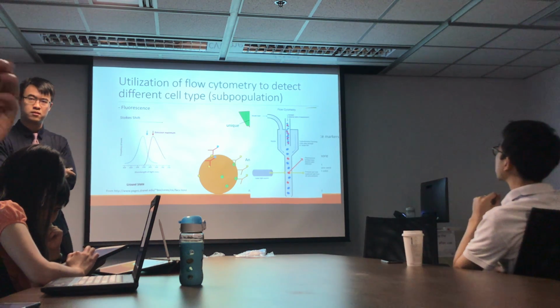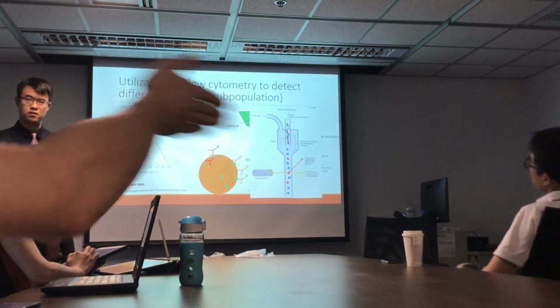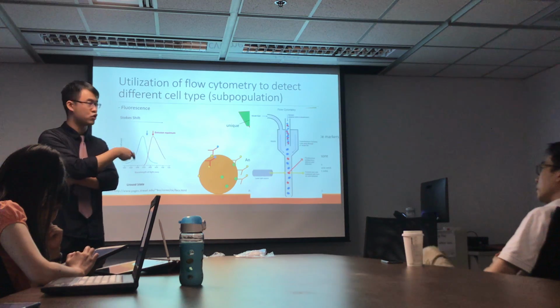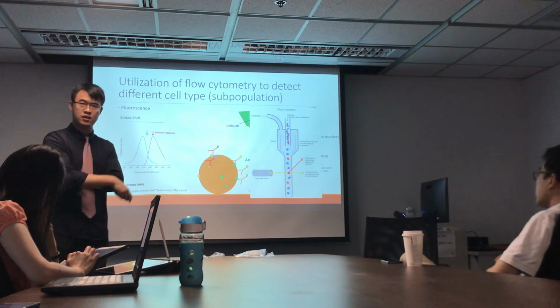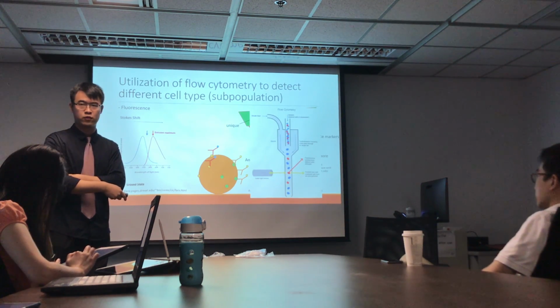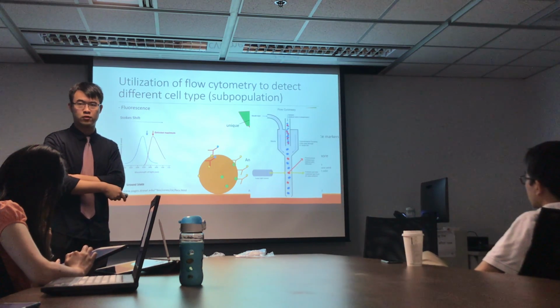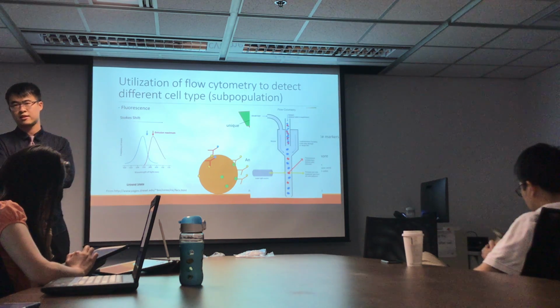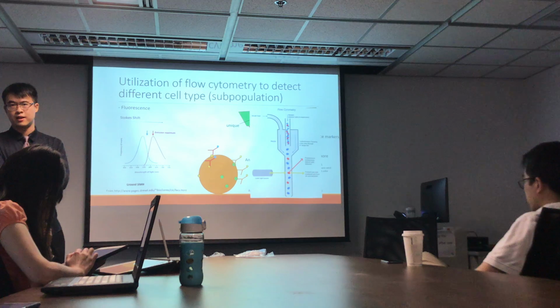I mean, actually, they are using the side detector to detect the light. No, it's a different fluorescence detector, which I will talk about in the next few slides. They don't use the side detector for detecting fluorescence light, just side scattering itself. They have other detectors for detecting fluorescence light.